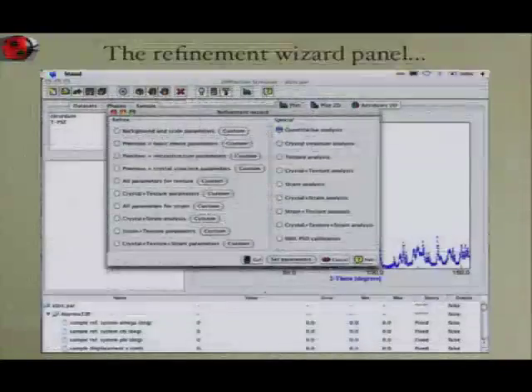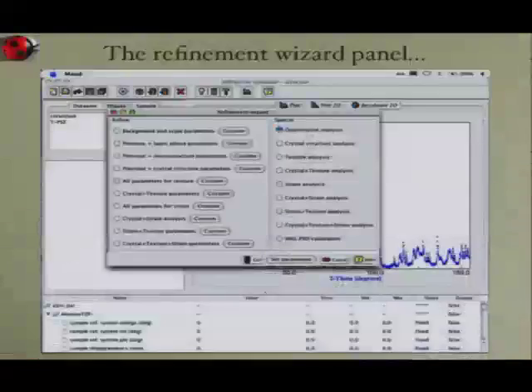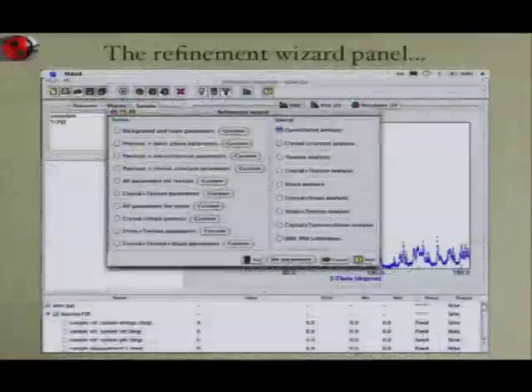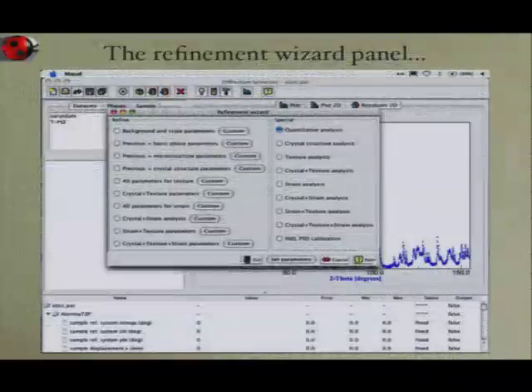So I use that one, use the wizard, so it sets the parameters for me, most of them, and then I just go and change a few, because maybe I don't want to refine this, but another one. Keep in mind that these work with most of the simple analyses material scientists do, but it doesn't fit all that you want to do.